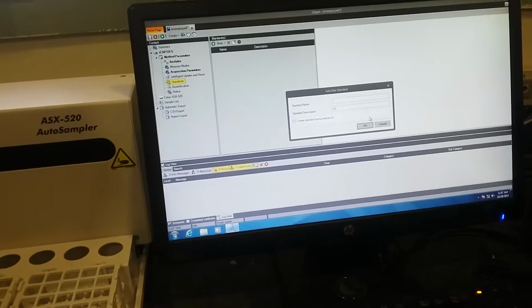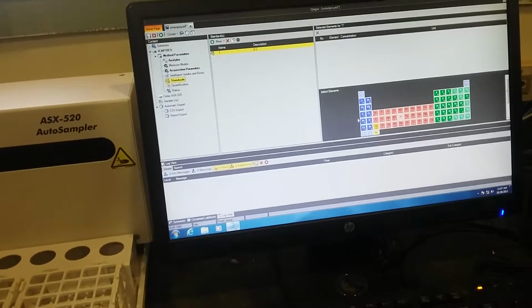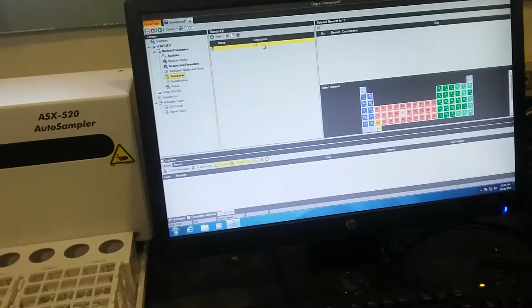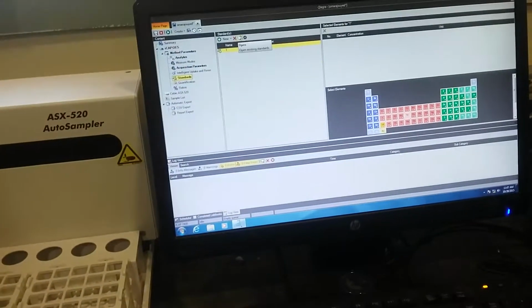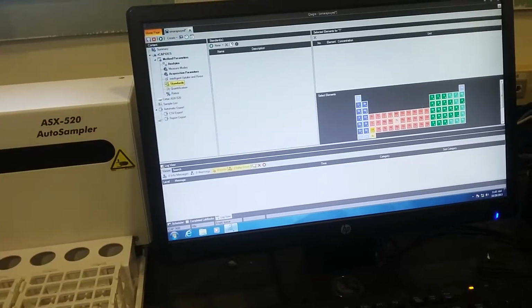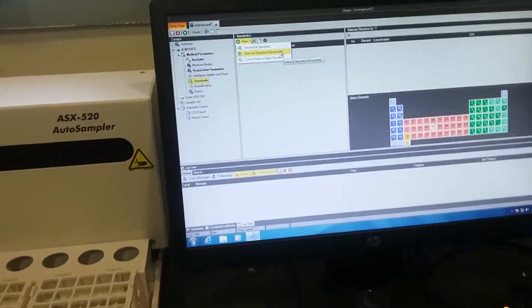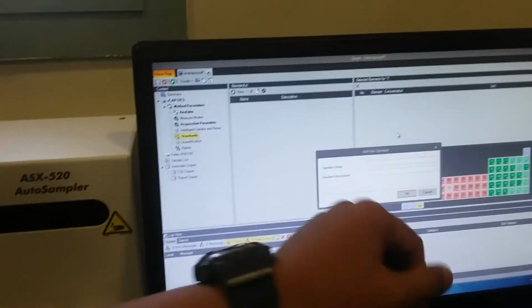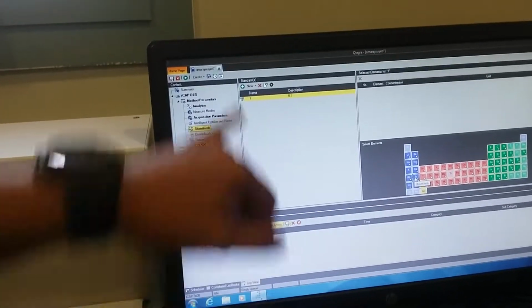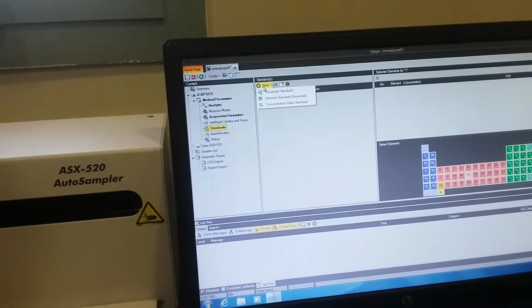Okay, problem. What happened? Then you have to select here. No, go back again. I'll explain the difference. Delete. New. Delete. Okay. New. Elemental. Put the name. I think it will be the same. Delete again. We will explain the difference.